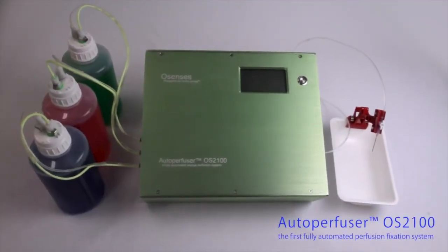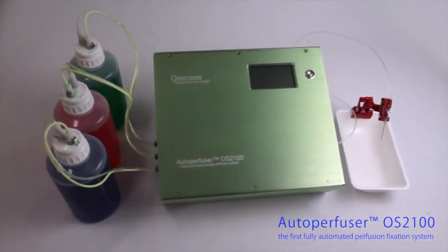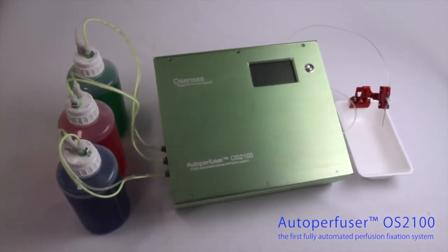The Osensis Autoperfuser is new and unique, and has been engineered to precisely address these problems.